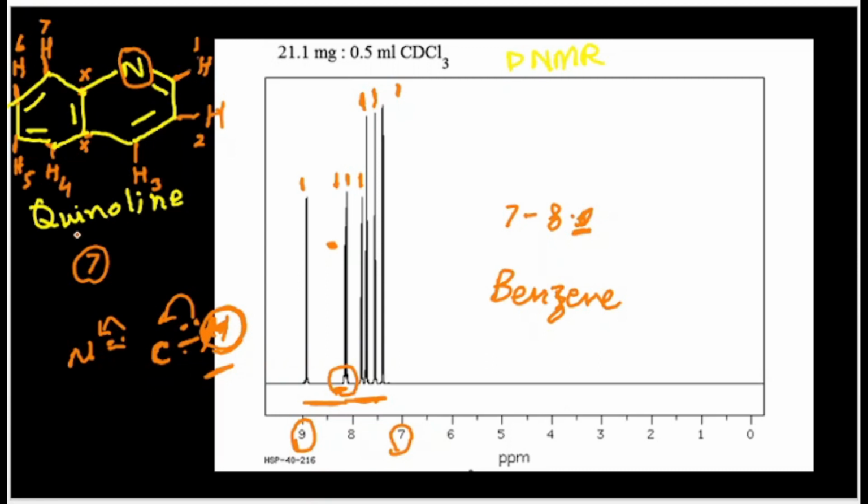So that was the structural elucidation of quinoline.